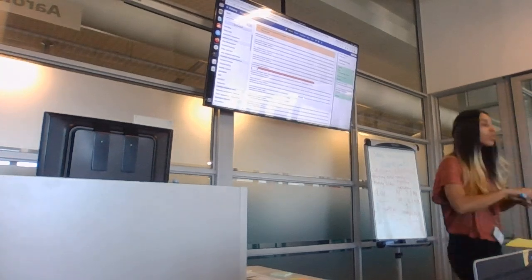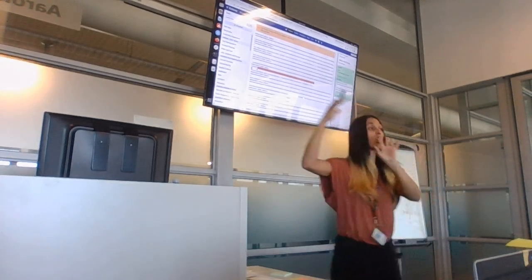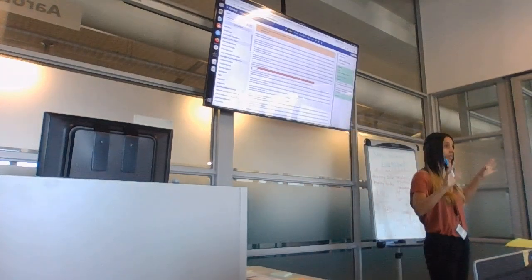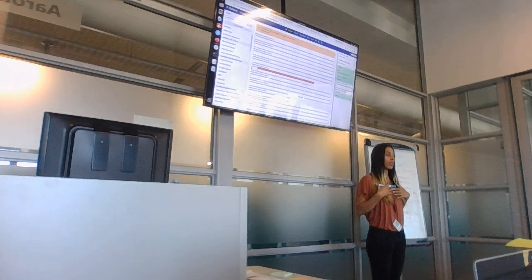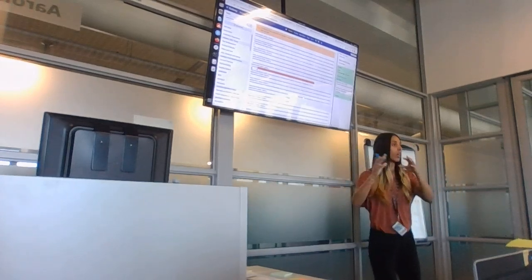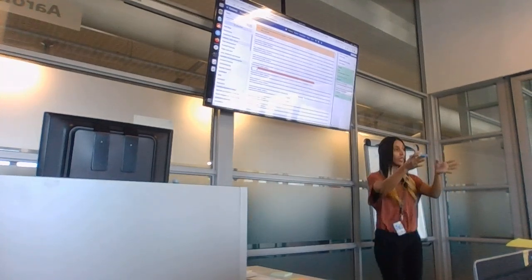So if you compare a human reference genome to an E. coli reference genome to a cholera reference genome, they're going to be completely different. So if I come here with a sample of chopped up human reads, and I compare to all three of those, whether they sequence this sample this way or that way, I'm comparing all the reads to this, then to this, then to this.